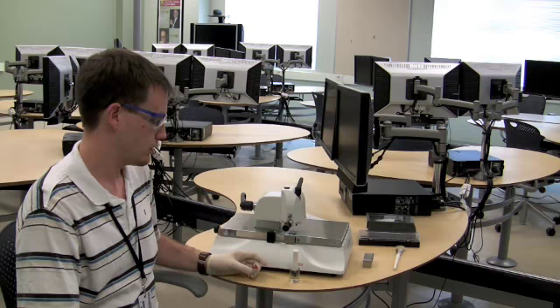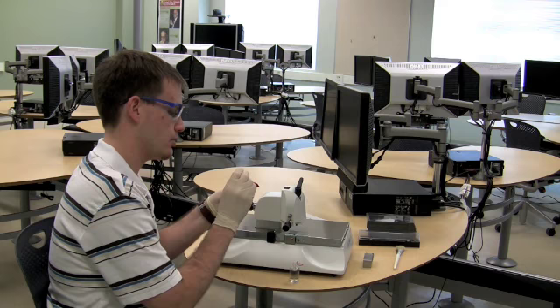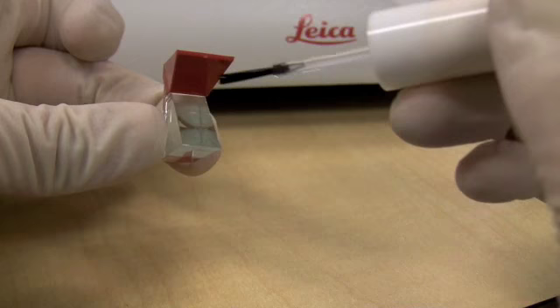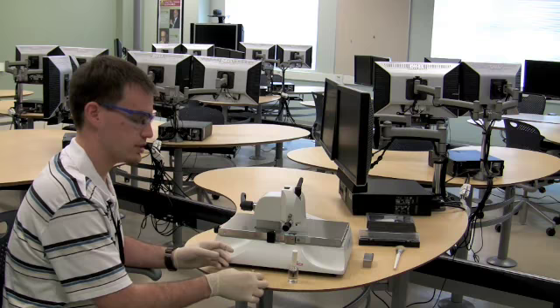Once the trough is stuck to the glass, we're going to take the nail polish again and we're carefully going to apply it to the outside of the trough and the glass. We're going to let this set, and after it's finished, we'll be ready to use it for sectioning.